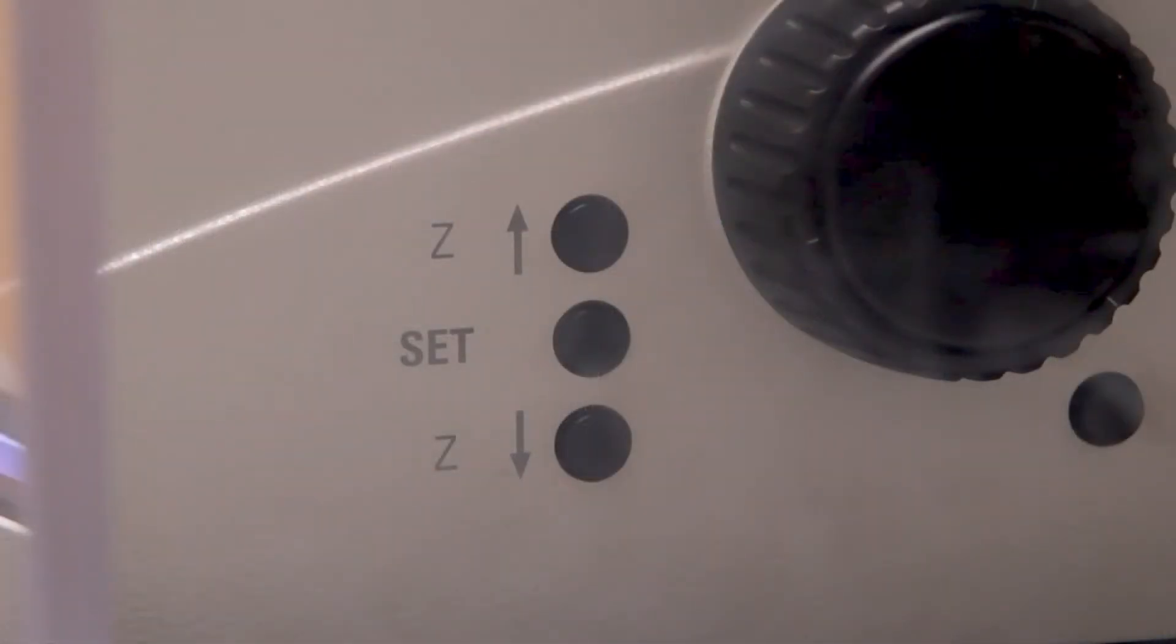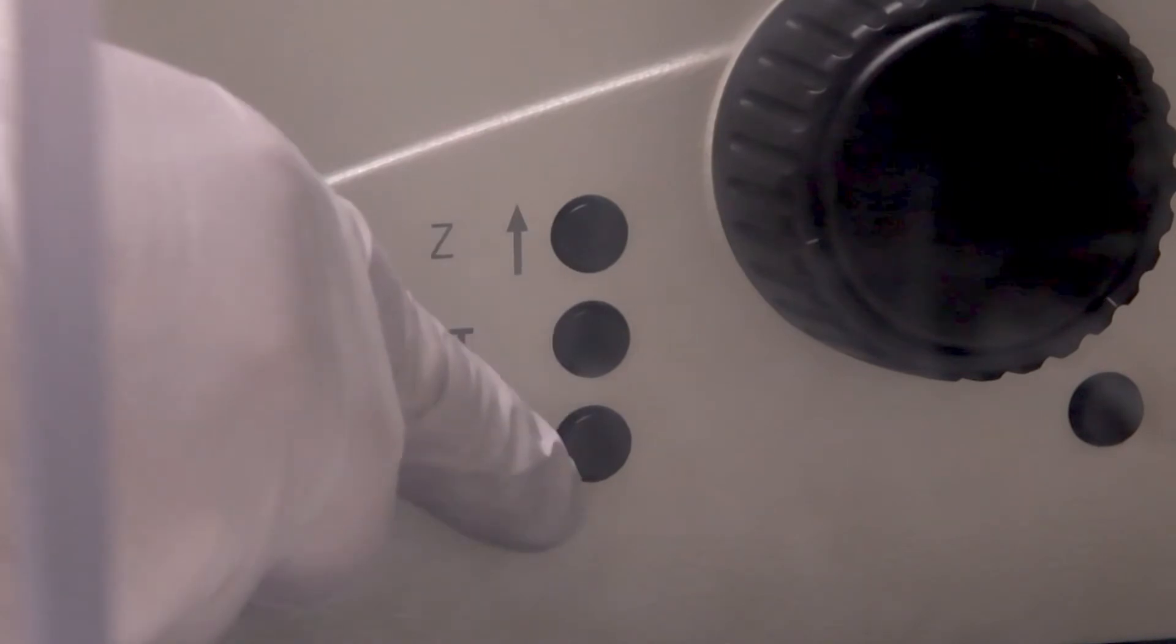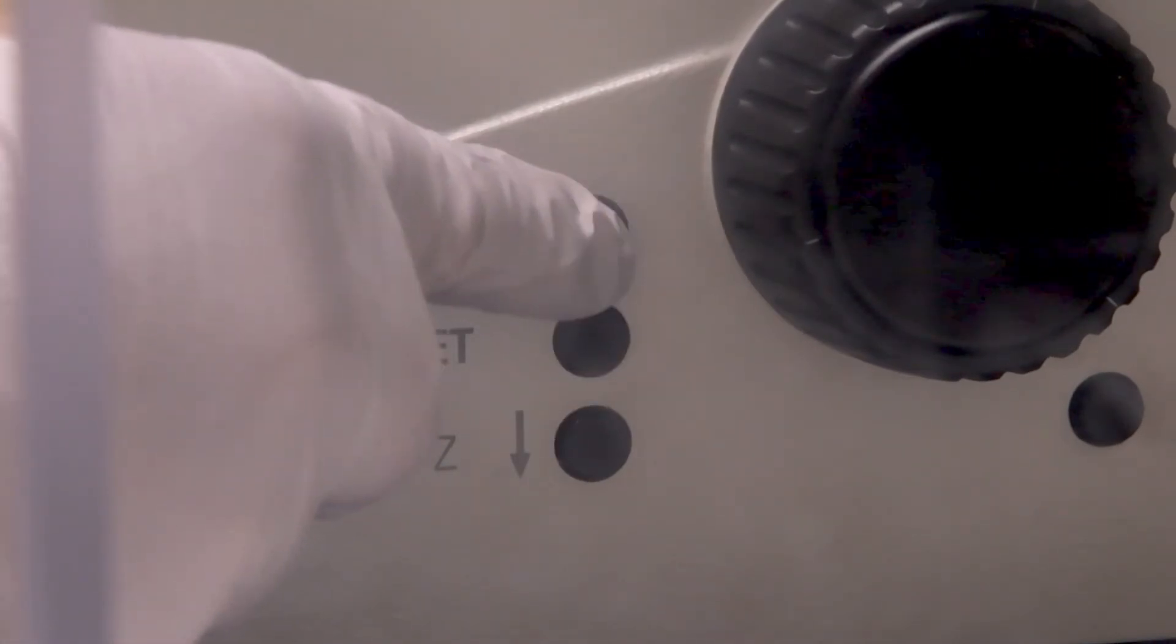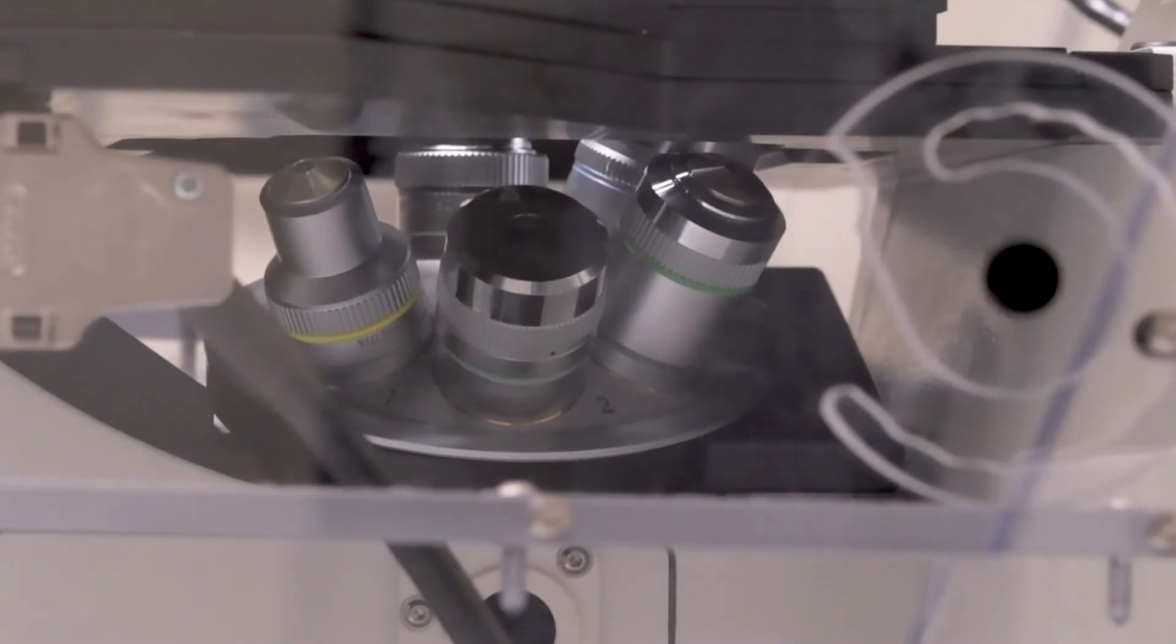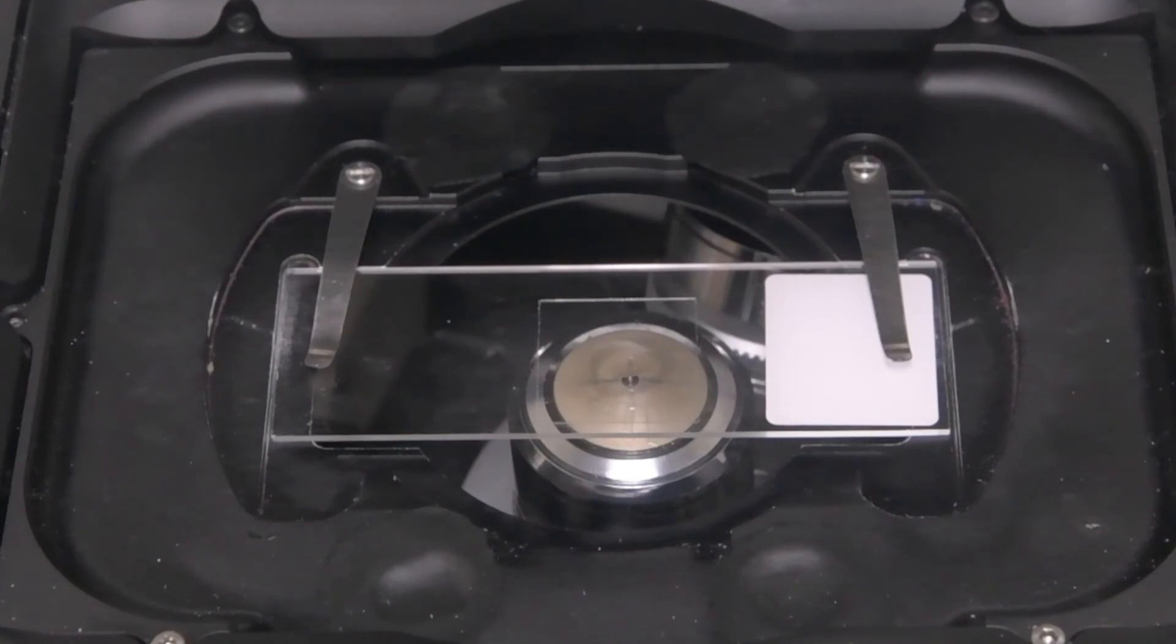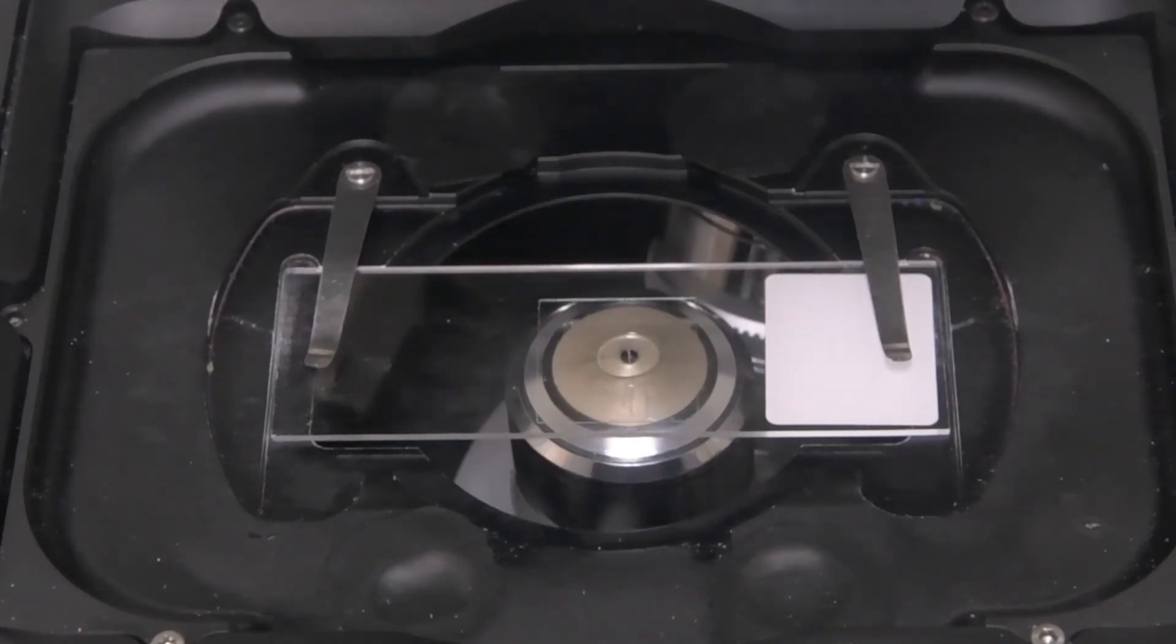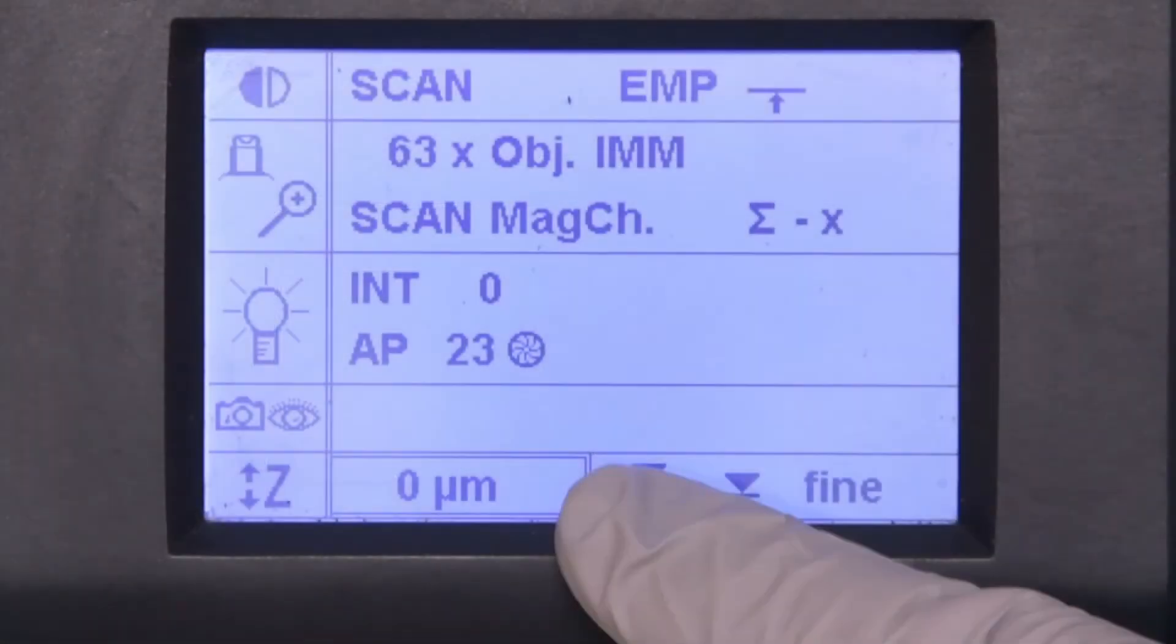So having given that disclaimer, look for the three buttons on the right side of the microscope again. Push and hold the top button. This will bring the objective up to the zero position. Make sure to watch the slide while you do this. The lens will come up and touch the oil and stop right there. You can actually see it touch the oil and spread a little bit. You can see in the LCD on the front that it now shows the position as zero.